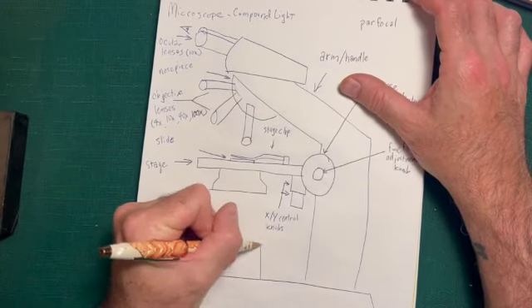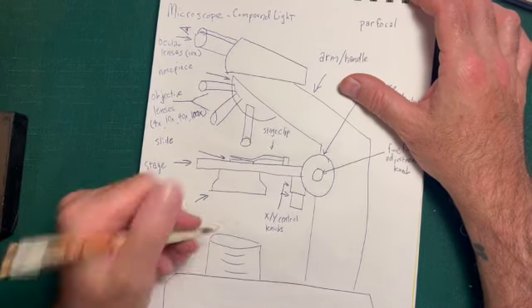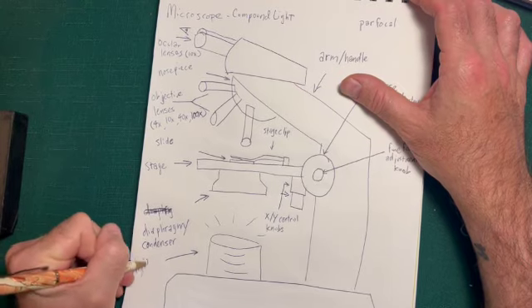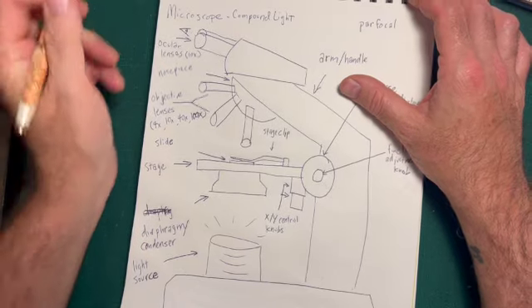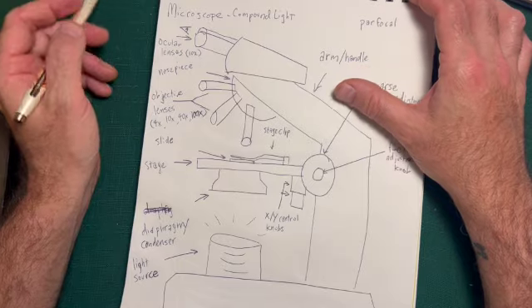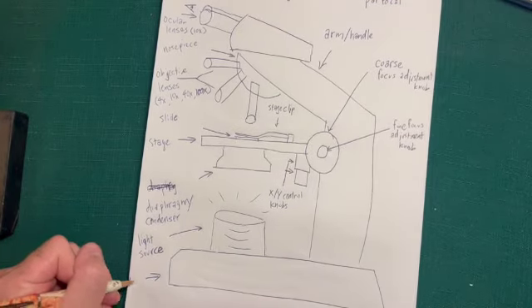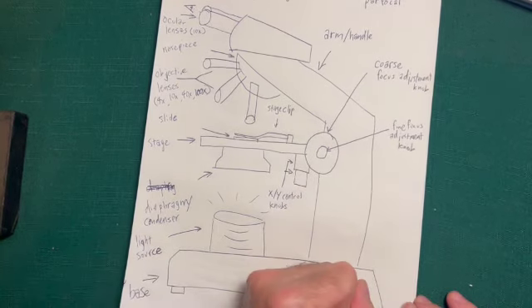Okay, speaking of the light, the source is going to be down here. Give it some bright, shiny lines. So it's going to be our light source, which is adjustable, and I'll show you how we adjust it. We have a control for that. We typically find that within this piece down here, which is called the base of the microscope. And typically it rests on 4 rubber feet.